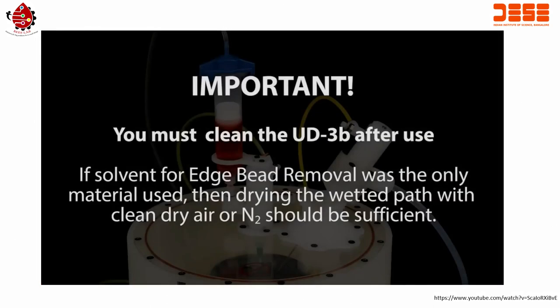We recommend you clean the UD3B at the end of every day. If all that has been used is solvent for edge bead removal, then drying the wetted path with clean dry air or nitrogen should be all that is necessary.